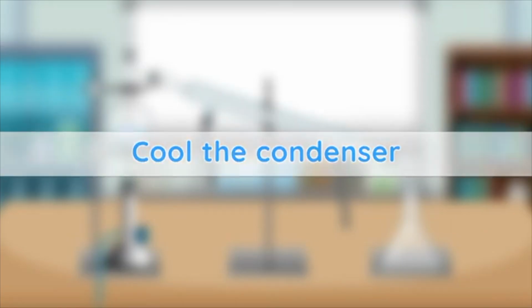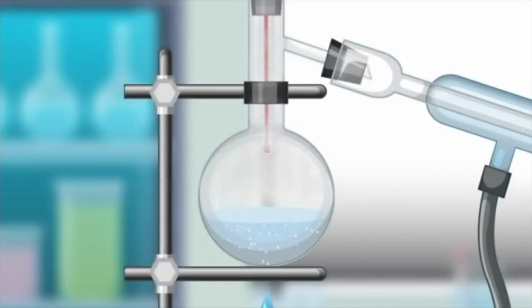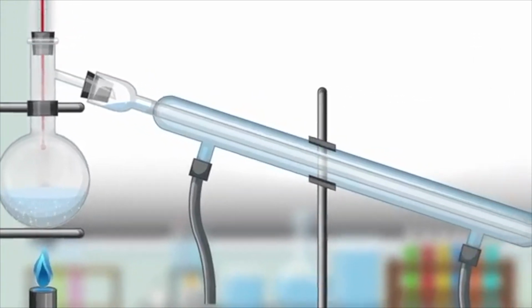Condensation is the other half of the distillation process. Condensation is defined as the conversion of a vapor or a gas to a liquid. Condensation is initiated by the formation of molecular clusters of vapor within a gaseous volume. Condensation occurs when a vapor is cooled or compressed past its saturation limit within a given volume.